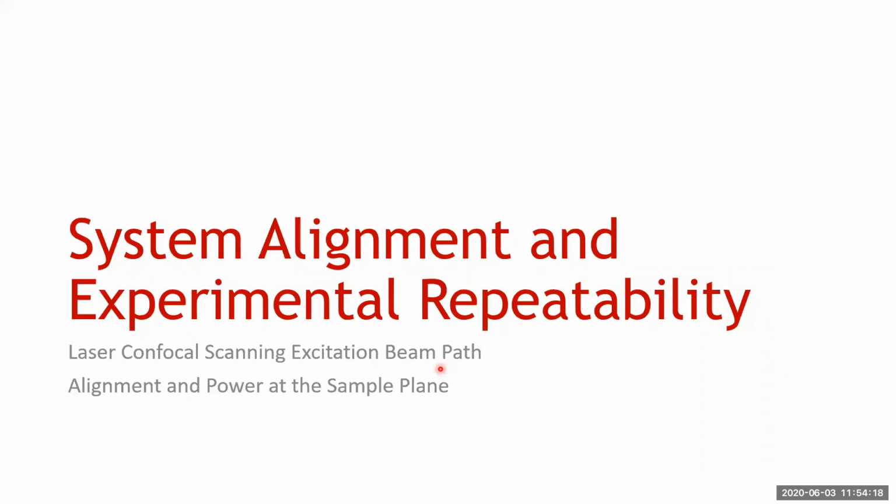Sorry, repeat the question again. You want to be quicker, and have less file size? Yeah. Okay. Well, that doesn't really work. Yeah, but I'm just trying to understand, if I increase the bit depth and reduce the resolution, well, you can increase your resolution by everything that I just mentioned. You can reduce the scan speed by having a smaller field of view if you can afford that. You can increase your resolution, especially by putting down more pixels, but that actually will decrease your scan speed. I assume you're talking about confocal scanning here.